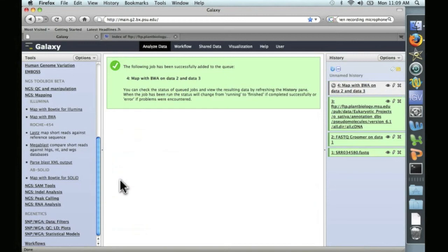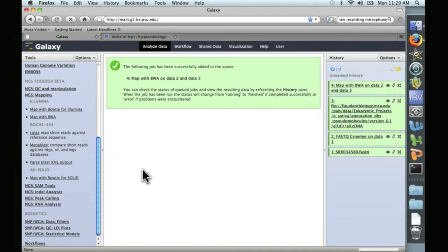And we'll be back when the alignment is done. And we're finished. That took about 15 minutes.